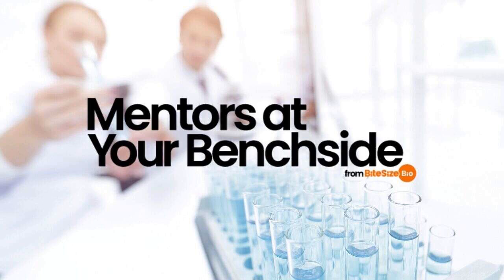Number 2, omitting the primary antibody control. Incubating the sample with an antibody dilution buffer without the primary antibody will reveal if the observed signal is due to the non-specific binding of the secondary antibody in the tissue or cell sample. Sometimes, secondary antibodies form aggregates and can be seen as debris in the sample. This can happen due to improper storage conditions.